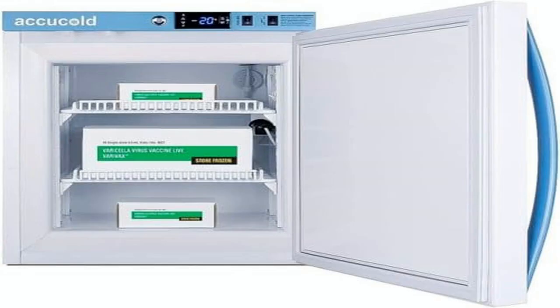The unit's rating on Amazon is a modest 2.6 out of 5 stars from 18 reviewers, suggesting a mixed experience among owners. While I can't quote specific complaints, that score typically points to issues like temperature consistency, noise level, or durability over time. Speaking of temperature, the freezer advertises a medical grade, which generally means it can reach at least -20°C, -4°F. In practice, that range is sufficient for most vaccines and most laboratory reagents, but it's not the ultra-low temperatures you'd need for long-term biobank samples. If your protocol demands -80°C storage, you'll be out of luck.